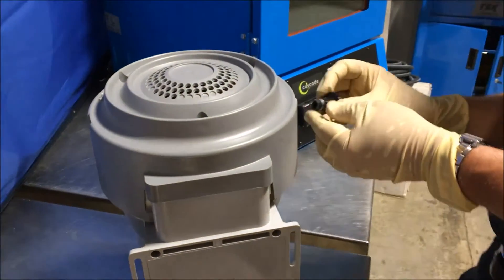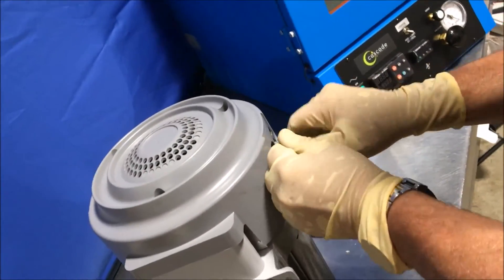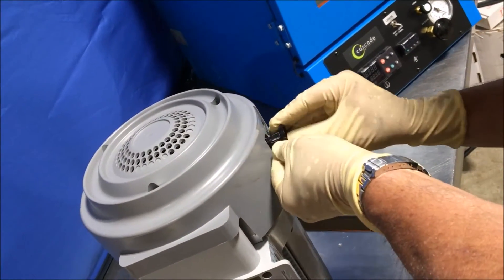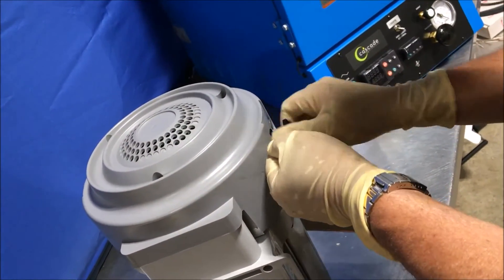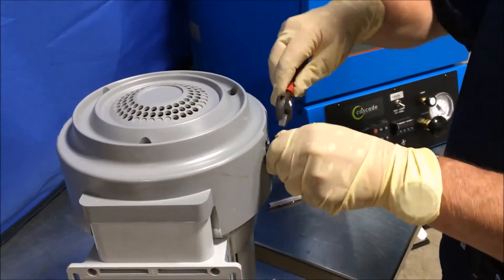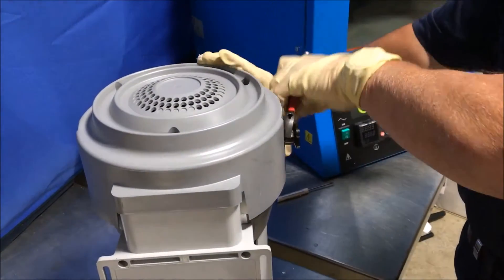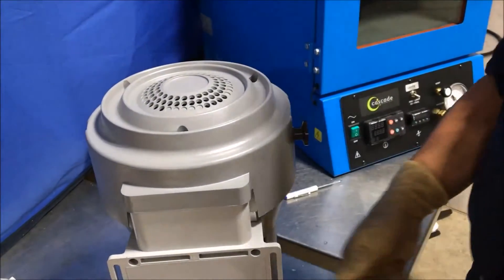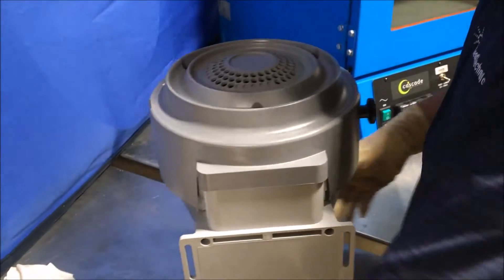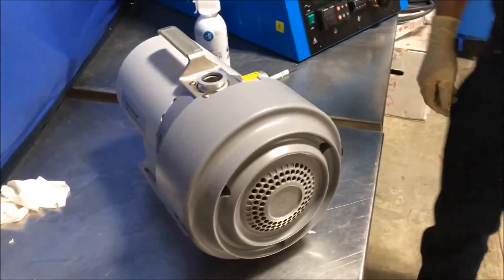Next, we replace the exhaust port. The pump is now ready to operate.